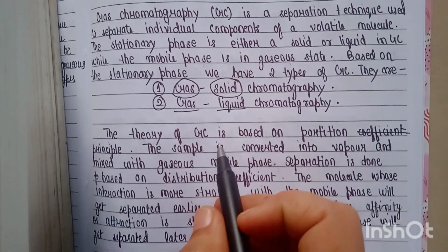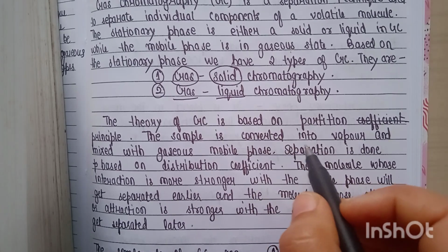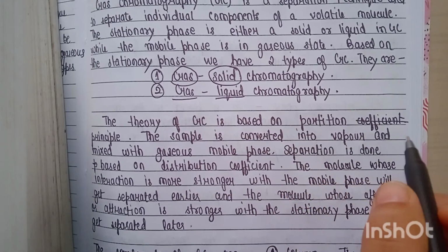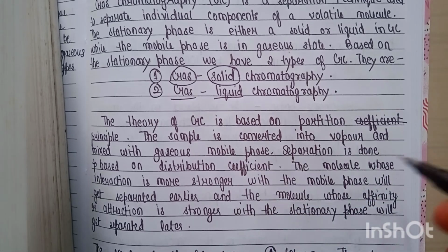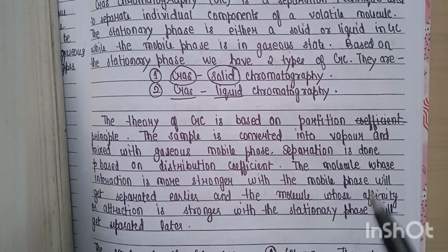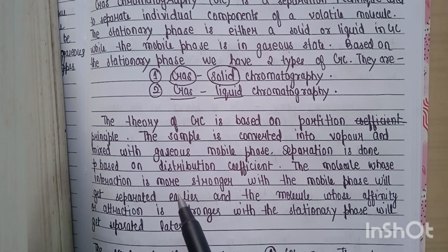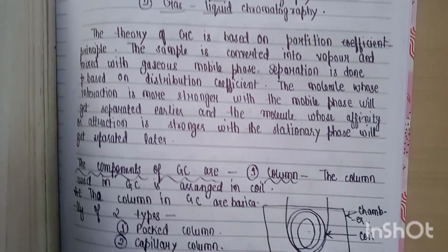The theory of GC is based on partition principle. The sample is first converted into vapor and mixed with a gaseous mobile phase. Separation is done based on distribution coefficient. The molecule whose interaction is more with the mobile phase will get separated earlier, and the molecule whose affinity or attraction is stronger with the stationary phase will get separated later.